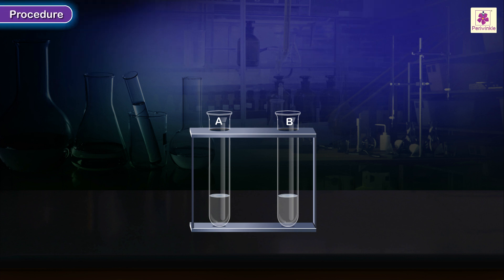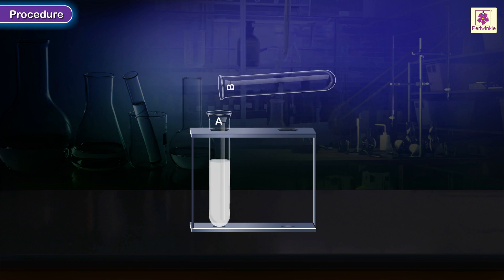Procedure: Pour the contents of one test tube into the other and observe the changes, if any.